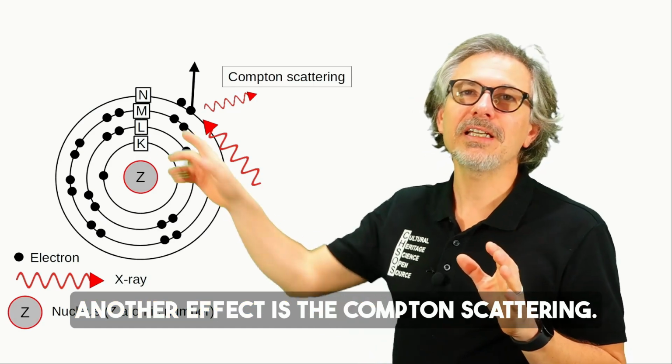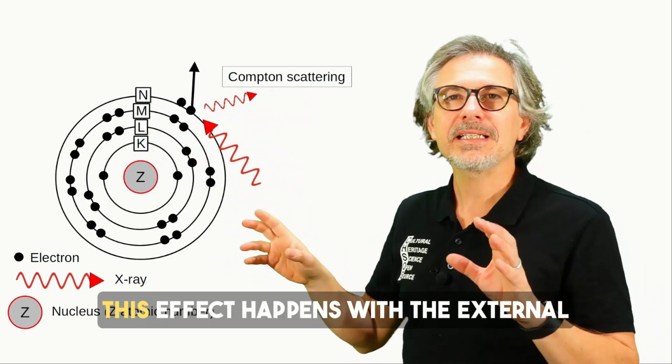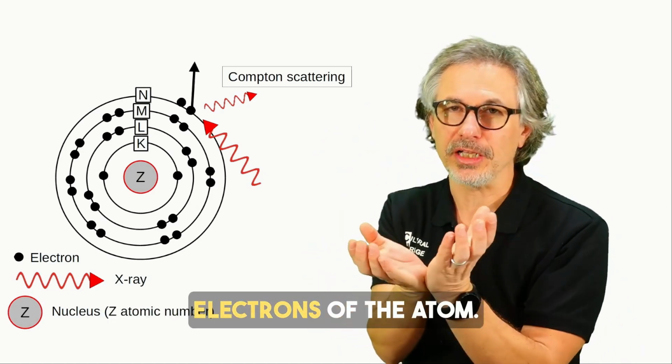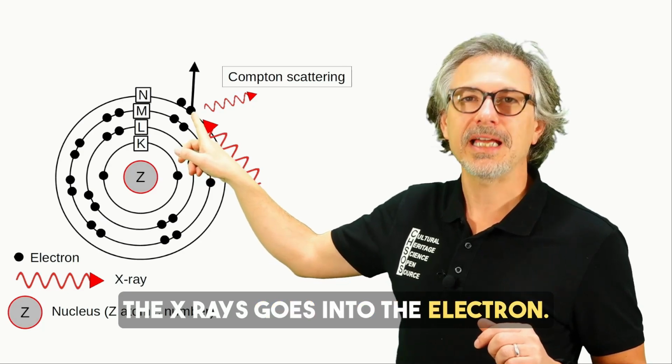Another effect is the Compton scattering. We have here the X-rays. This effect happens with the external electrons of the atom. The X-ray goes into the electron.